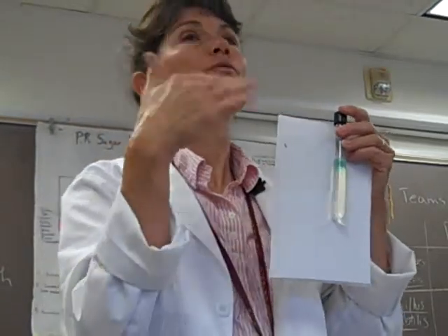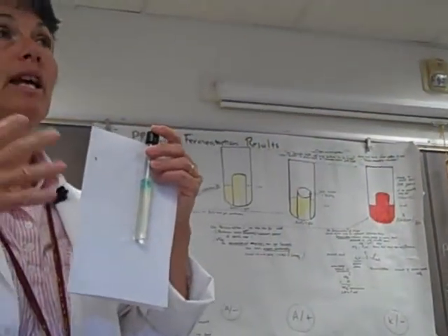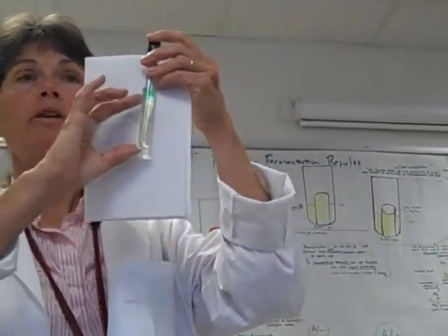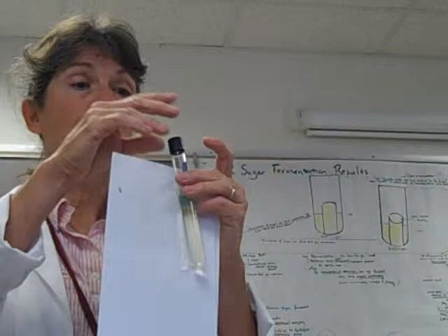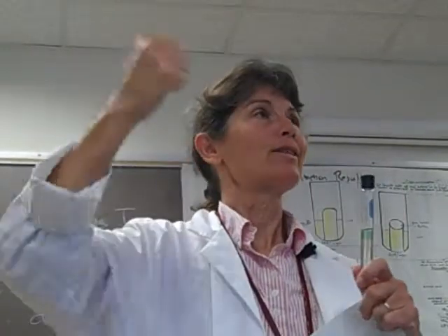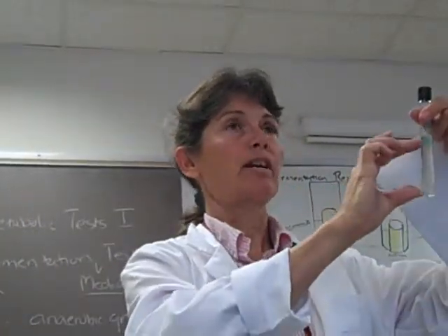Usually what you just have to do is re-autoclave it, and that will return it to primarily anaerobic. So be really careful, guys. When you come up and get your media, don't jostle them, don't shake them, because we need to keep this portion anaerobic.